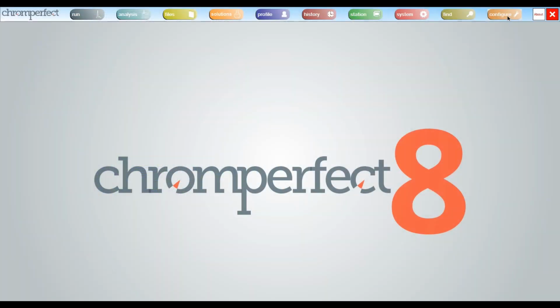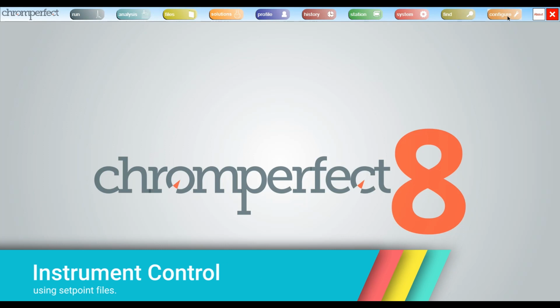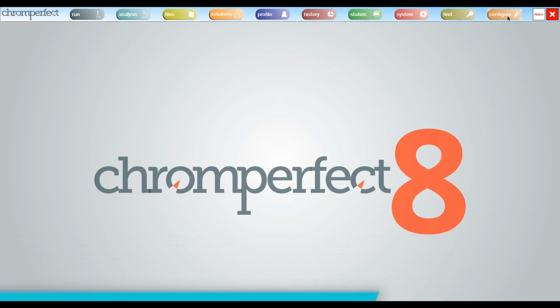Today we are going to look at a popular and powerful feature of Chromperfect to control a chromatography instrument, such as a GC or HPLC, and the associated auto-sampler, if one is present. We are using Chromperfect version 8 and Windows 11.